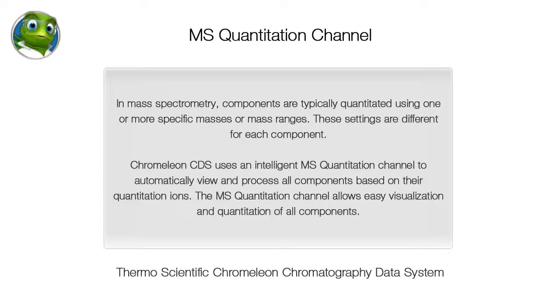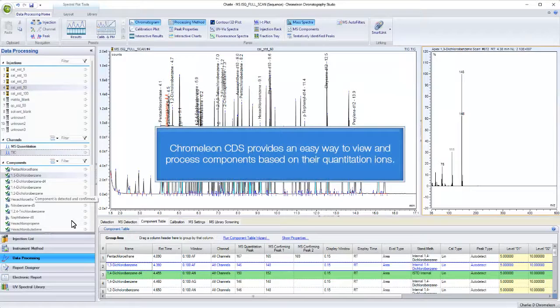In mass spectrometry, components are typically quantitated using one or more specific masses or mass ranges. These settings are different for each component. Chromelion CDS uses an intelligent MS quantitation channel to automatically view and process all components based on their quantitation ions. The MS quantitation channel allows easy visualization and quantitation of all components.